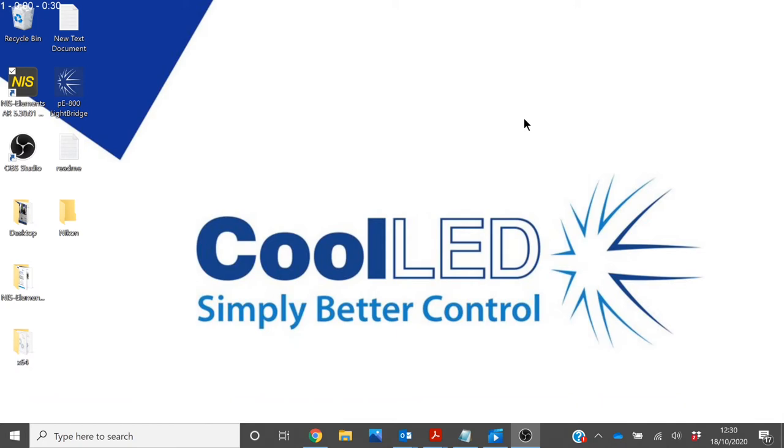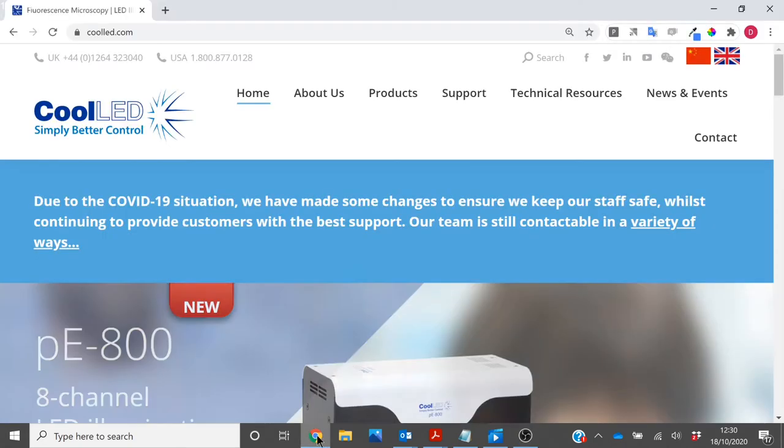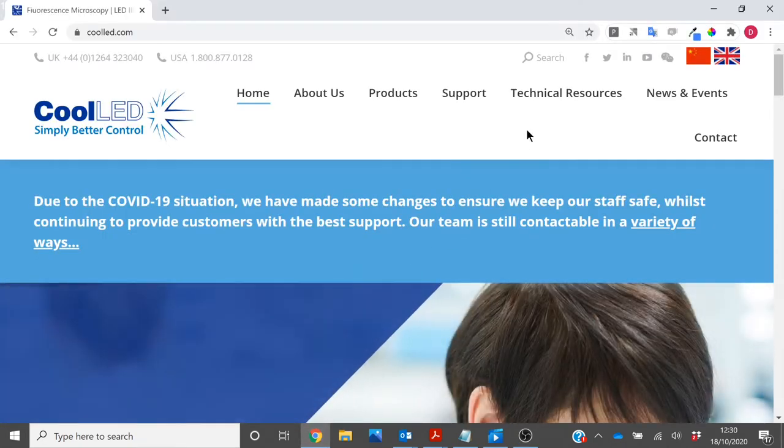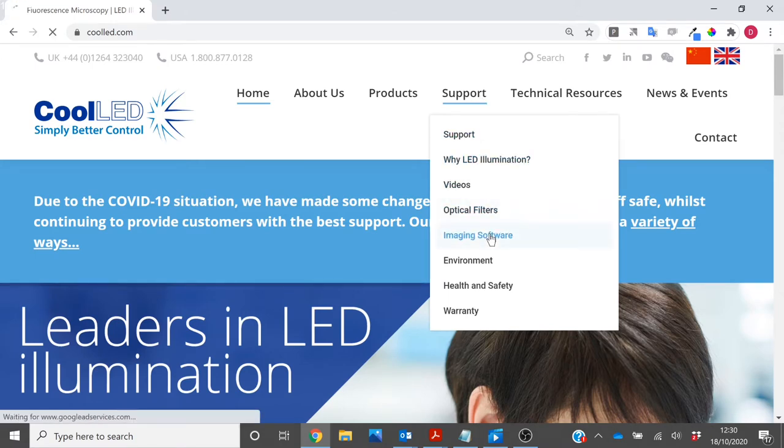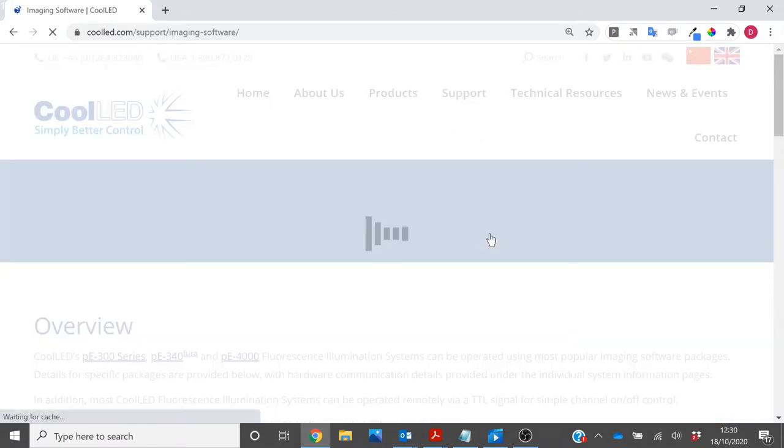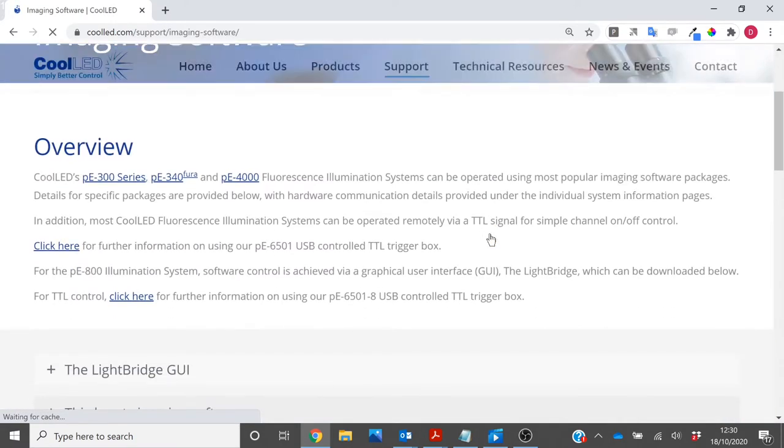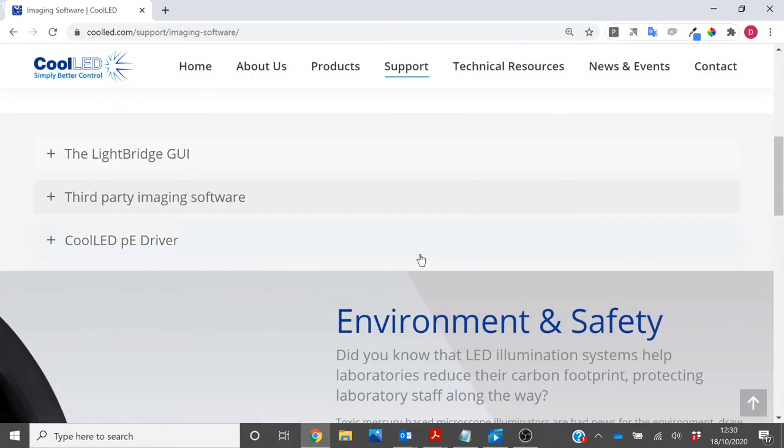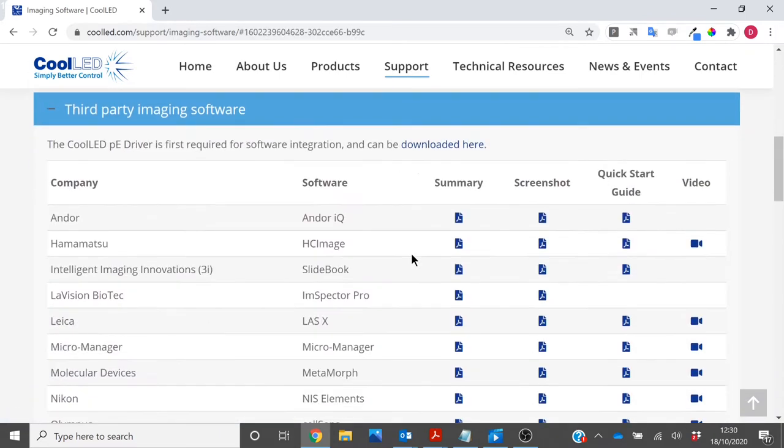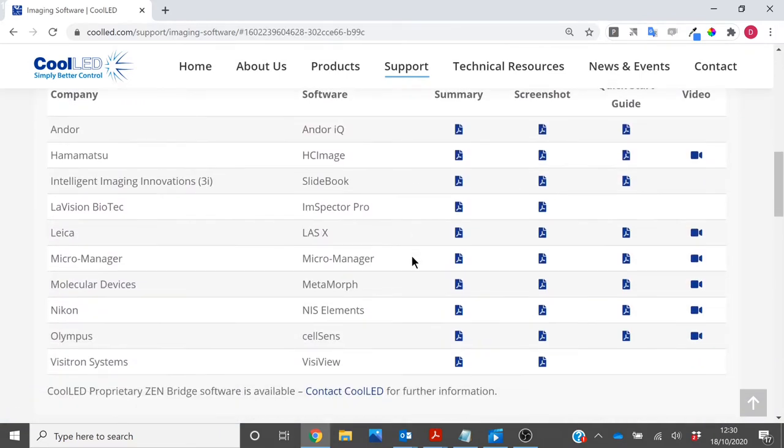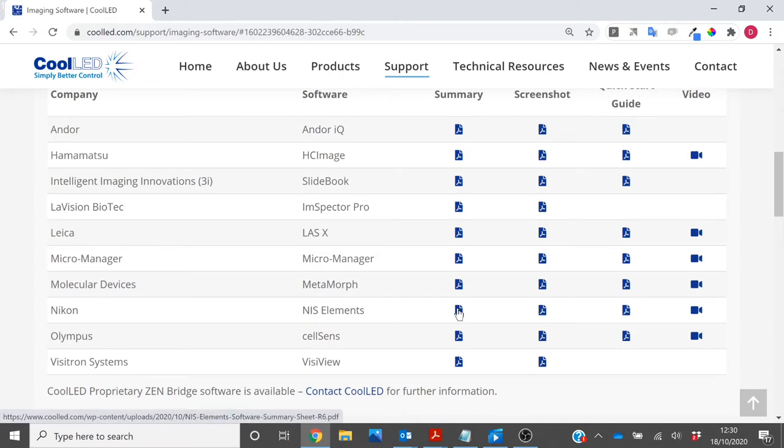To download the patch, you will need to go to the CoolED website, Support, Imaging Software, scroll down to third party imaging software, and select the summary sheet for Nikon NIS Elements.